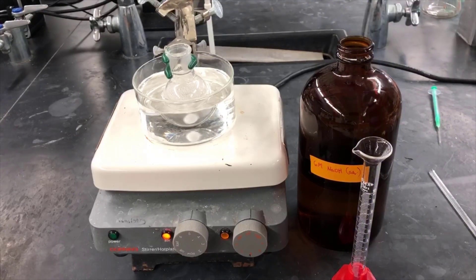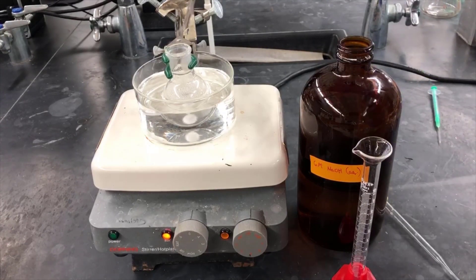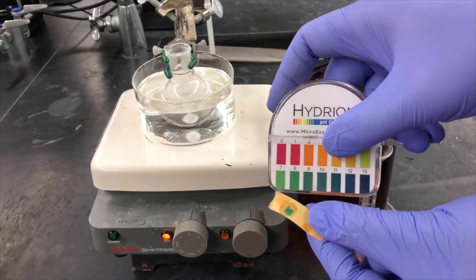I'll add another 1.5 milliliters of the hydroxide solution, and then test again with pH paper. Now the solution is sufficiently basic, with a pH of about 8 or 9.